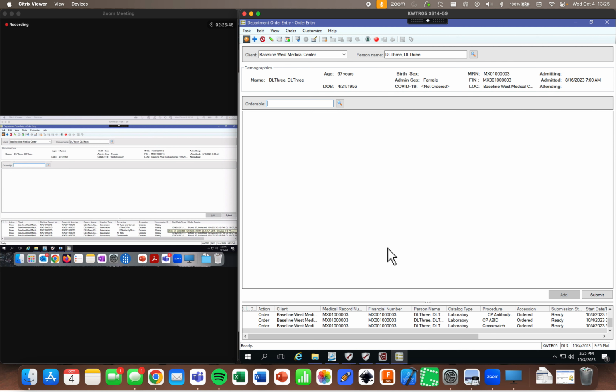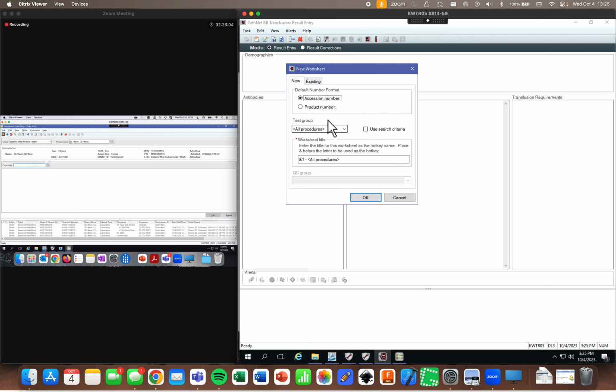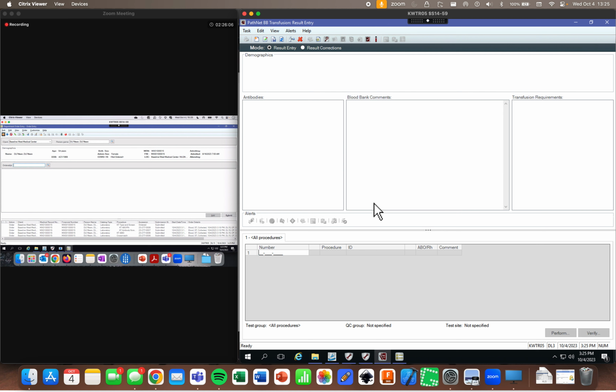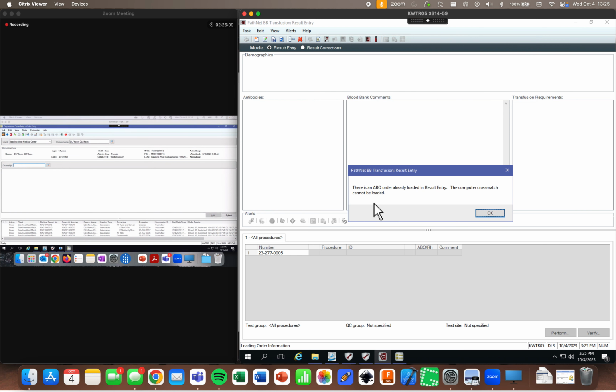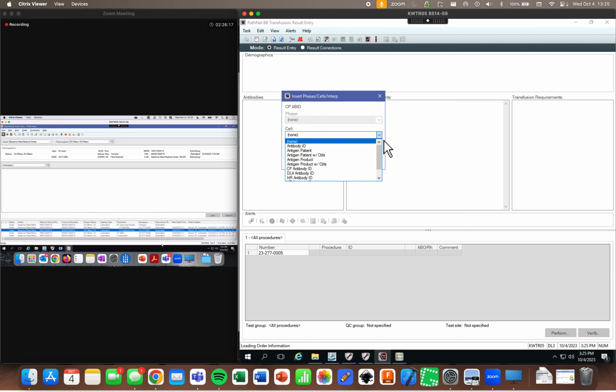And once I have all of my orders, I can go ahead and submit them. Now, if I do submit all of my orders in one lump sum, so I don't fill one in, submit, fill another one in, submit, and so on, but if I add them and then submit them, I should have, well, interesting. I should have just a single session number, but I do not.